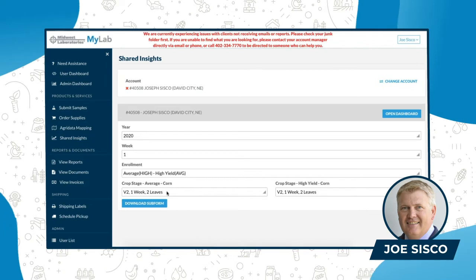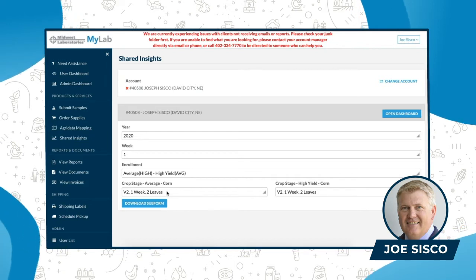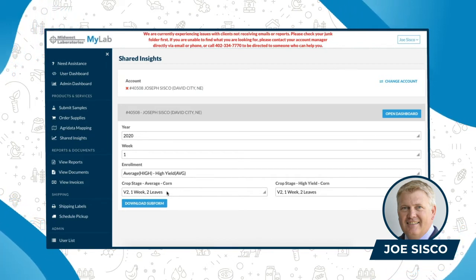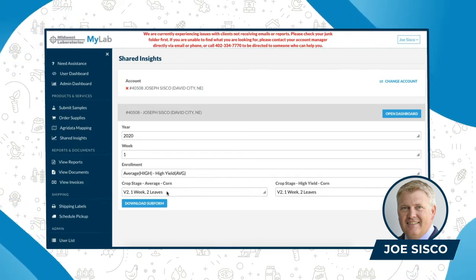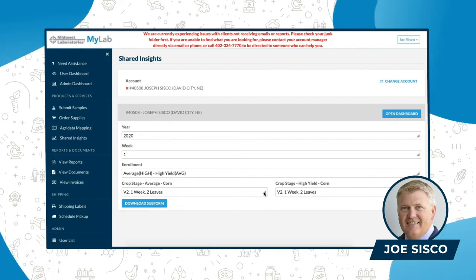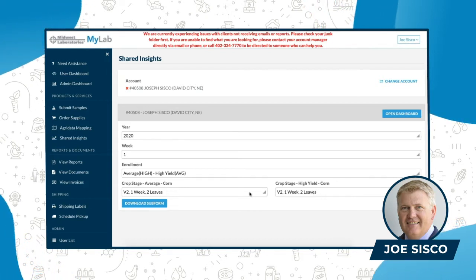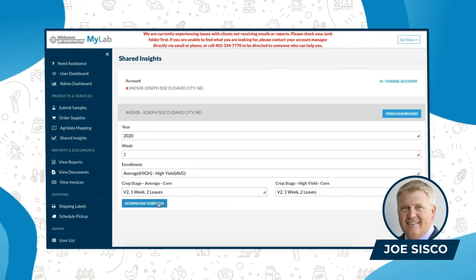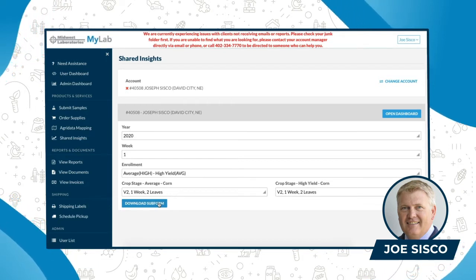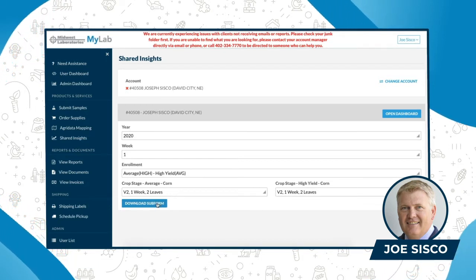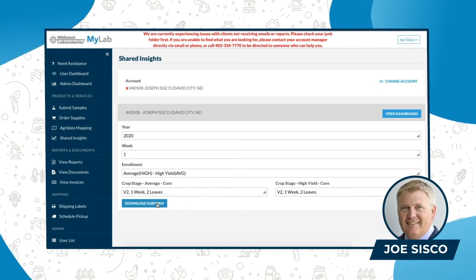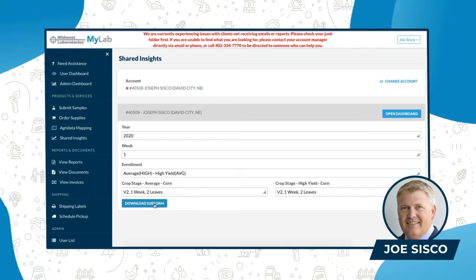The next thing I need to do is pick my growth stage for my corn, and V2 would be correct. Both halves are V2. So then I'm going to click on submit, or download the submit form here in blue.